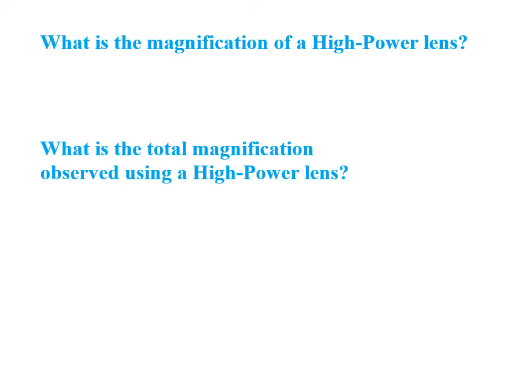Okay, so as I mentioned, we can either ask the question as, what is the magnification of a high power lens? In that case, I'm simply asking the magnification of that particular lens itself, which in the case of high power would be 40x. If, however, I said, what is the total magnification?